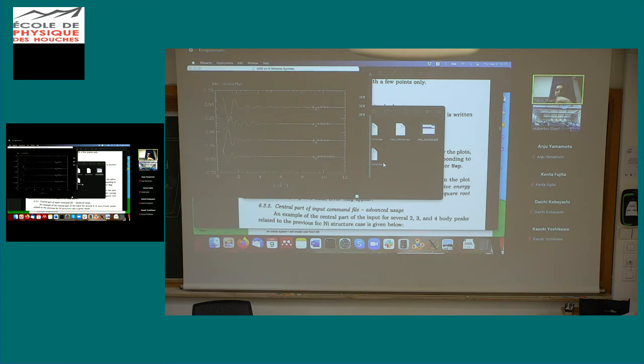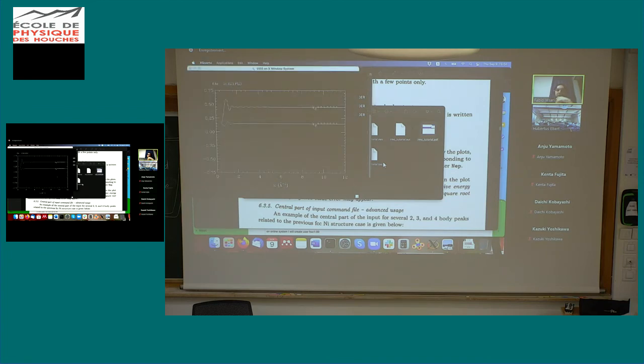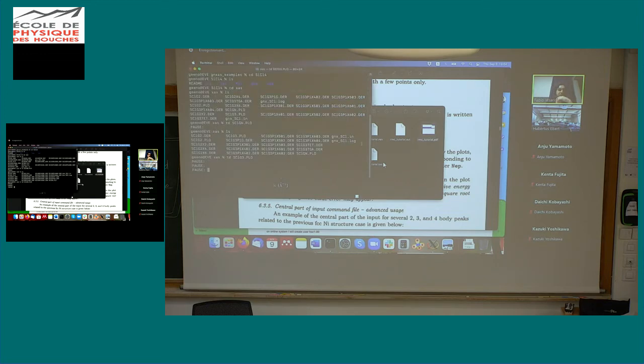And here it gives you also the atomic number of the path that the photoelectron takes. So this one, and then up to the 6th order, because we calculated up to the 6th order. But you can see that already at 6th order, the signal is basically already 0, so it's sufficient.